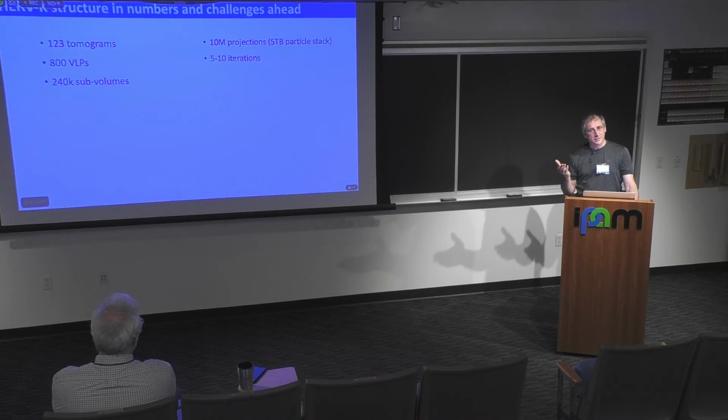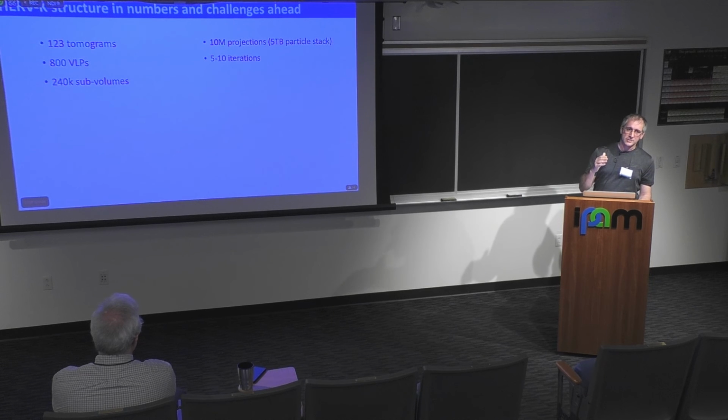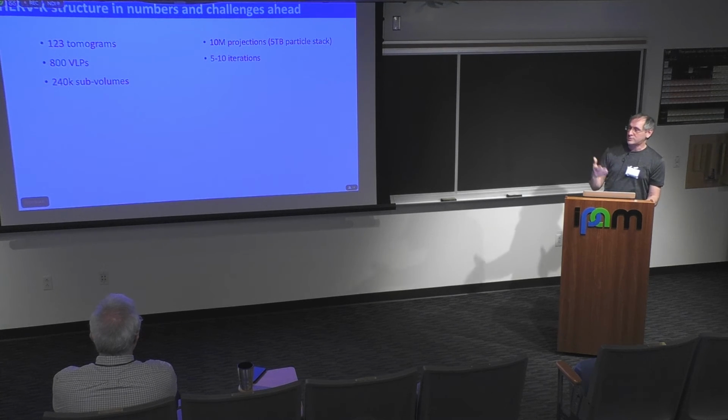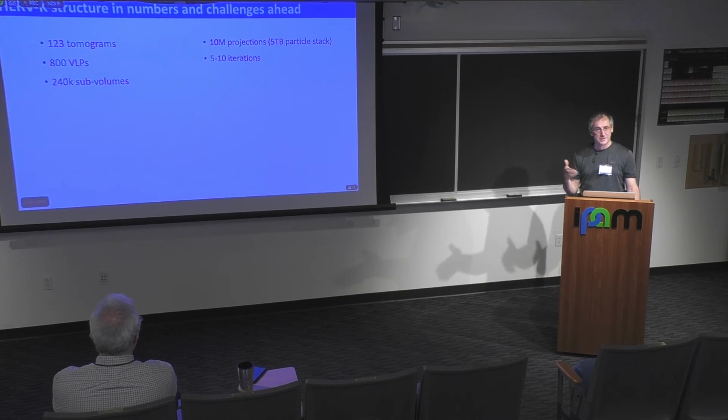Now, if you do constrained single particle tomography, where you actually go to the 2D projections, you're looking at a single particle problem where you have 10 million projections, right? This is something that the current tools can actually handle, but it's going to put a little bit of stress because there's a lot of projections that you need to refine. Even doing the reconstruction, if you knew what the orientations were, doing reconstructions of 10 million projections on a routine basis is actually not trivial, right? And we usually do this 5 to 10 times, right? So I think you can imagine some of the challenges here.